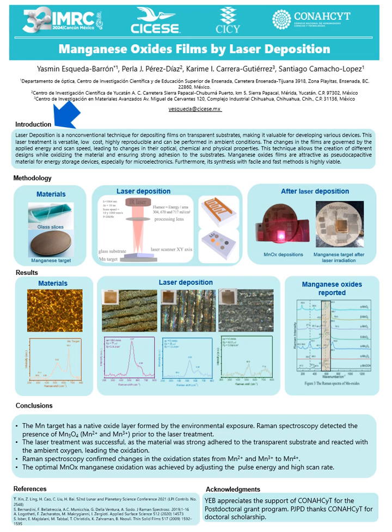Manganese oxides were chosen for this study because they exhibit various oxidation states, many of which are used in electronic, optical, and energy storage applications. As you can see here, only a transparent substrate and the target material are required. The substrate is placed over the target, and a focused laser beam is directed perpendicularly onto the target.